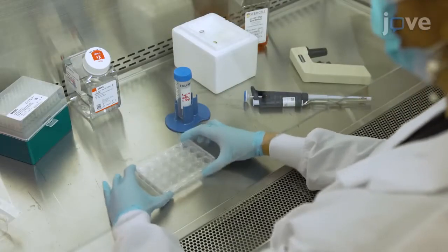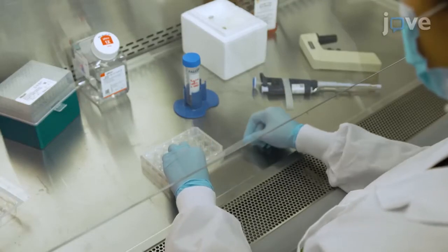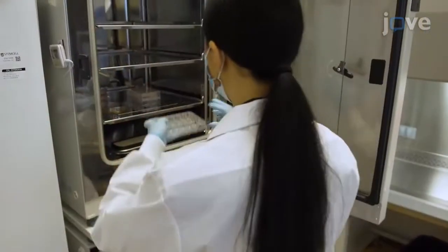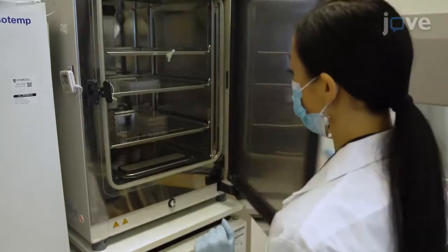Gently rock the plate from side to side to evenly coat the wells. Then seal the plates with a semi-transparent flexible film and store them at 4 degrees Celsius overnight. On the day of cell seeding, warm the pre-coated plates in a cell culture incubator for 30 to 60 minutes.